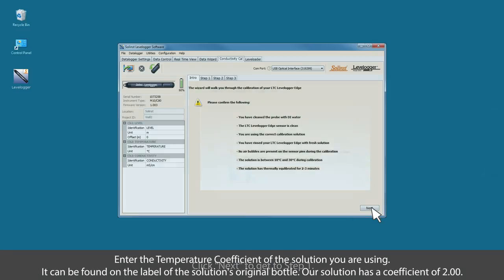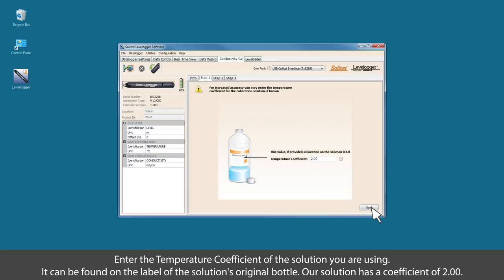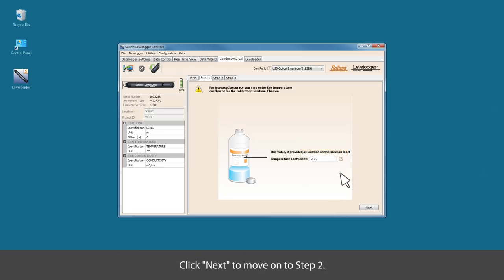Enter the temperature coefficient of the solution that you are using. It can be found on the label on the solution's original bottle. Our solution has a coefficient of two. Click next to move to step number two.